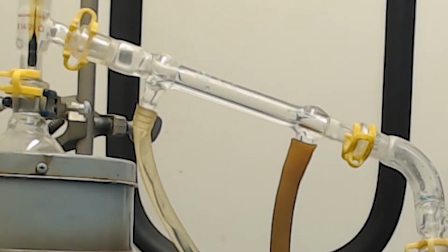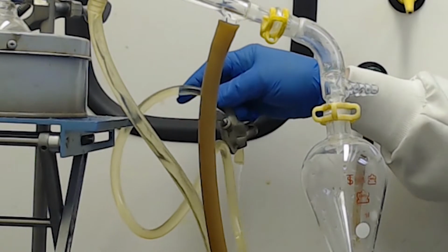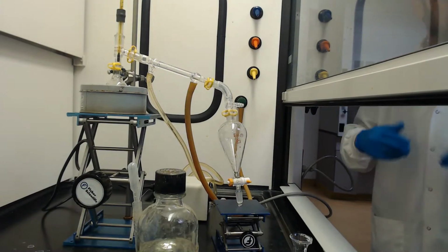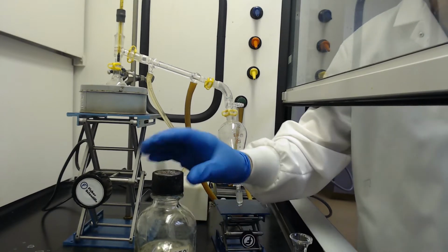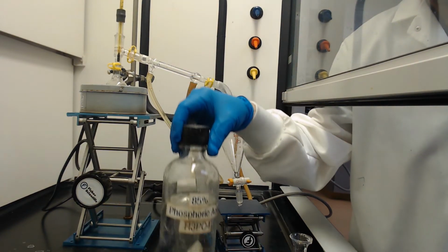So we can see that flowing, and I've got a flow right here, if you can see that flowing right here at a nice little clip. And you should be checking that occasionally, because these lab faucets can vary as you go along. Now the lab said to cool this. It's been our experience that we don't need to cool. This is 85% phosphoric acid.